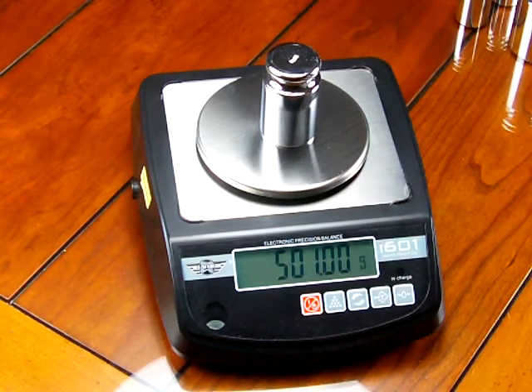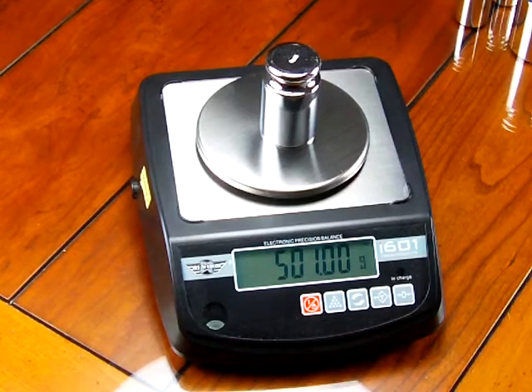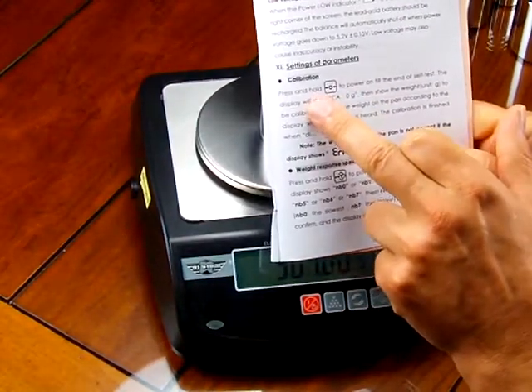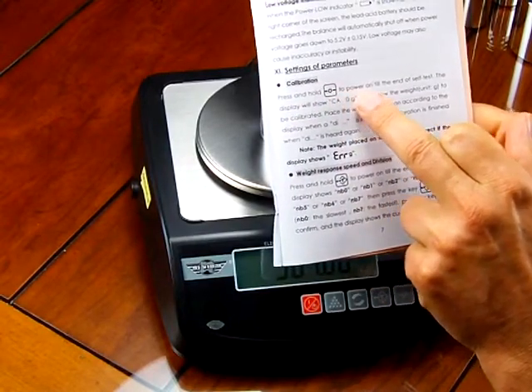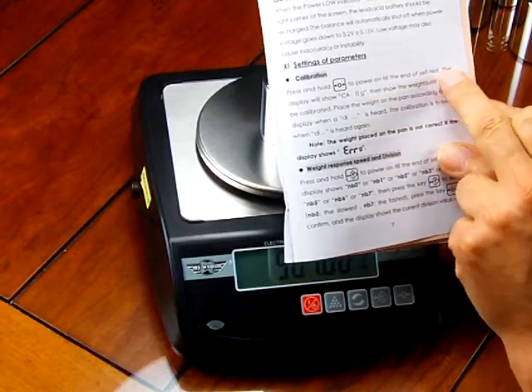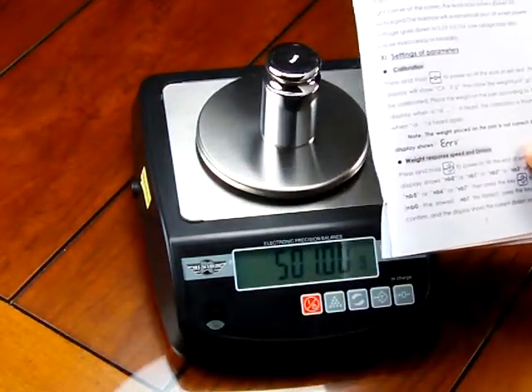So to calibrate the scale, the manual states and it's really not the clearest. The manual is right here on calibration. It's saying press and hold the zero to power on till the end of the self test. Some people might not understand what this means.